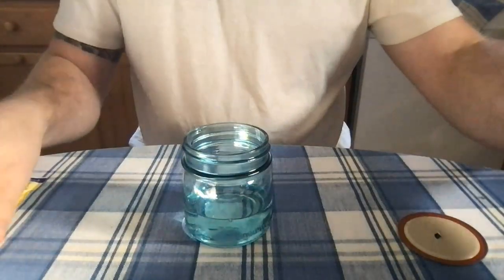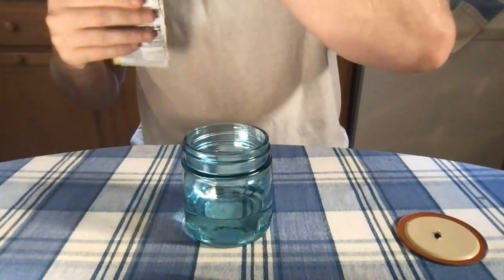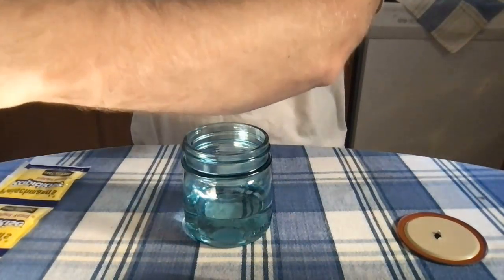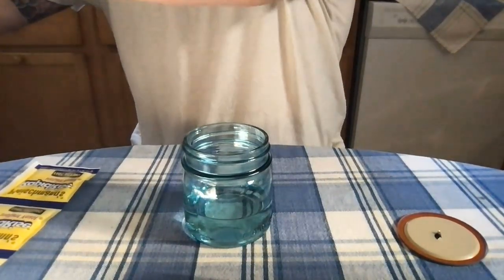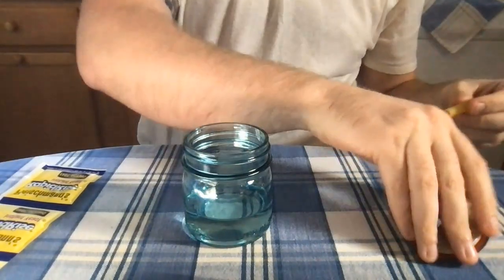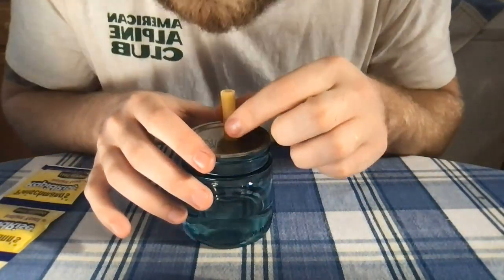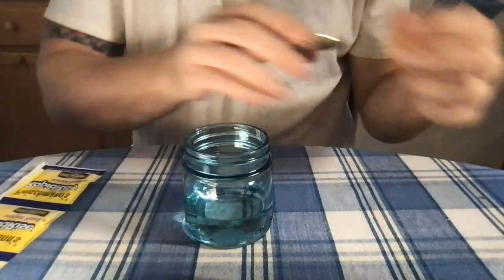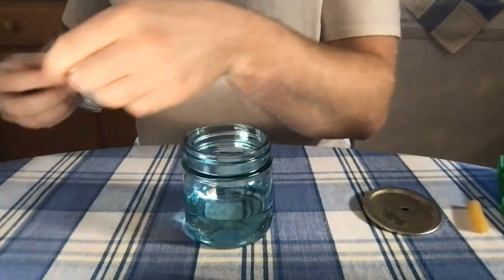Okay, so before I put the yeast in, I'm just going to get everything ready because this part has to happen pretty quick. So let's go ahead and grab our ZD here. Let's see, does this actually fit over? Yeah. Well, I guess we'll see. We have our lighter here.